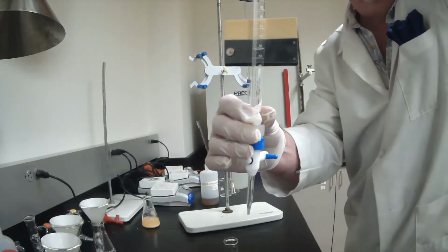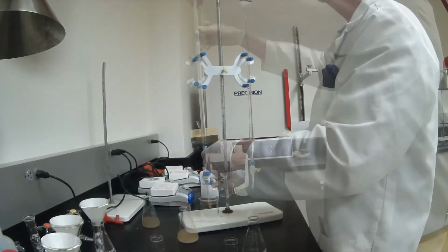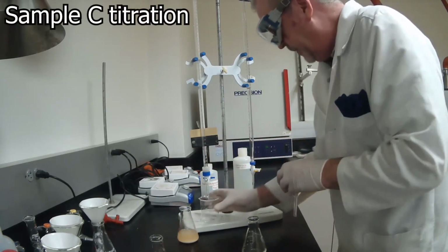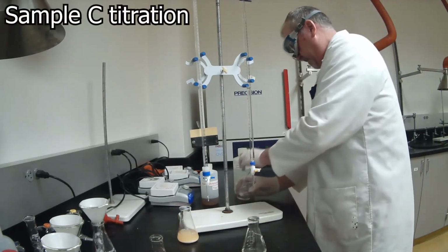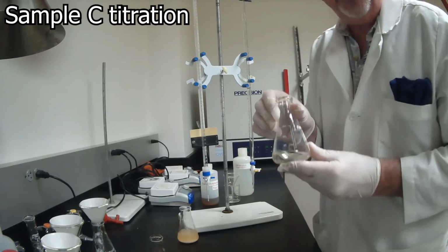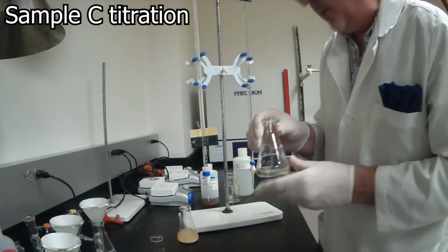So this was flask A, titration A, or sample A. Our initial volume in our burette is 0.00. And now we're going to titrate sample C, and then we'll have to redo B.